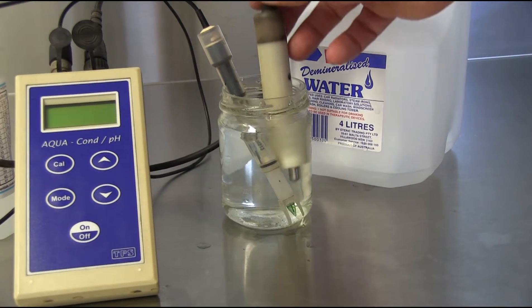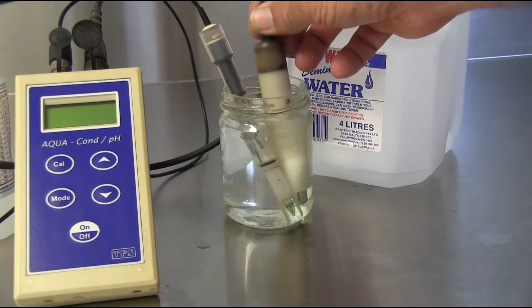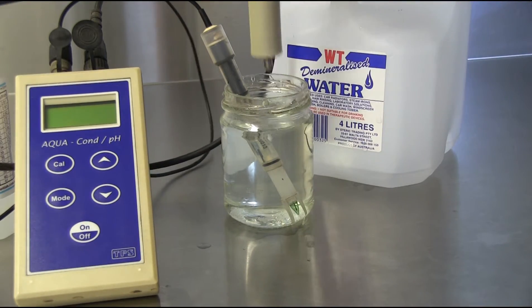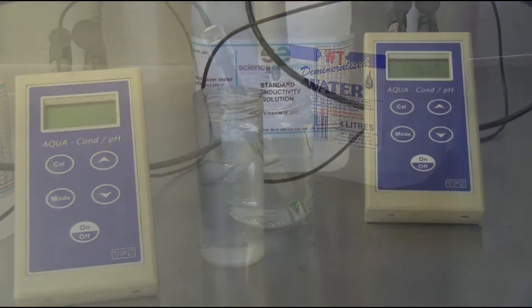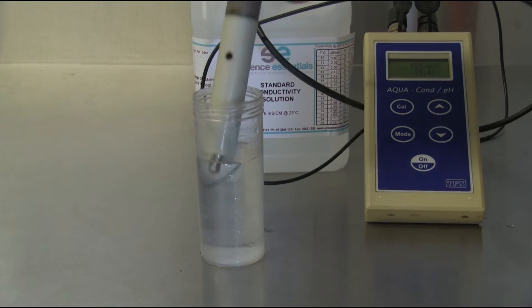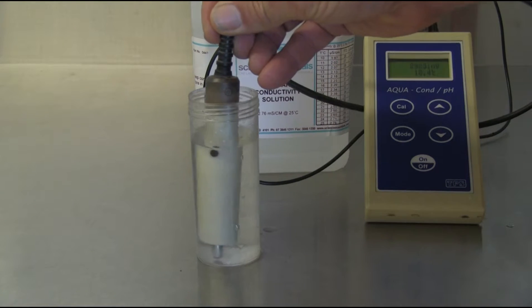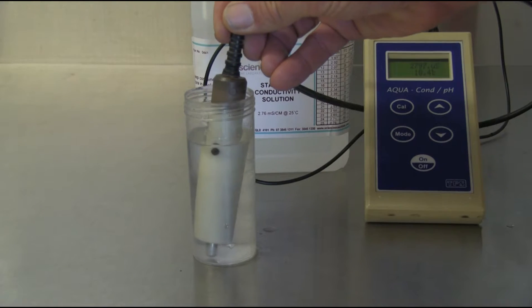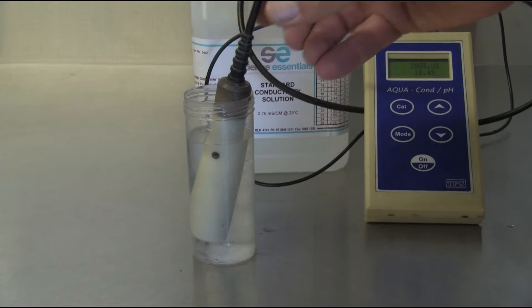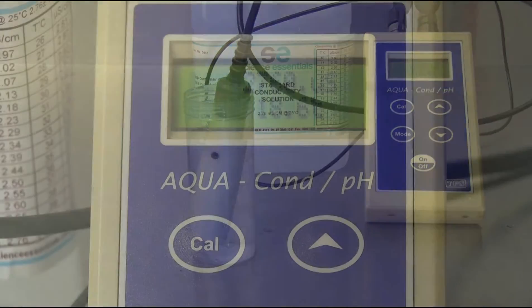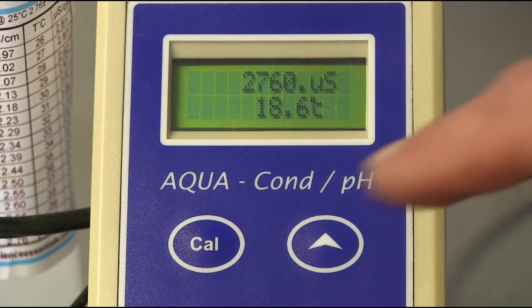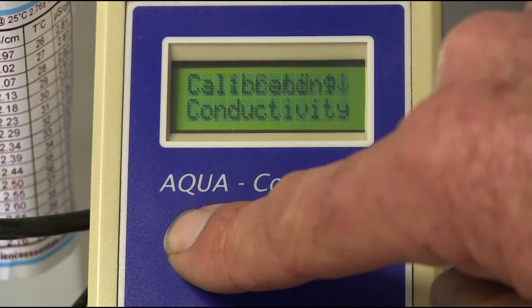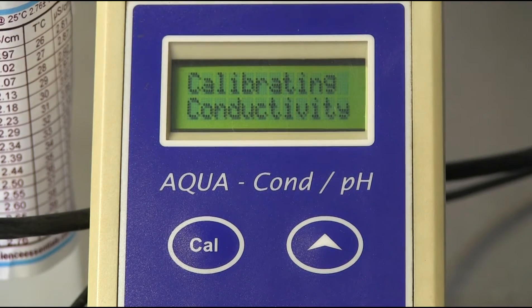Clean the sensor by carefully rinsing in distilled water and then gently shake off any excess water. Immerse the sensor in the standard solution in a plastic or glass container, ensuring the sensor is submerged to the depth of the hole and gently stir until the reading stabilizes. Select the EC calibration mode. Calibrate the meter according to the directions and check the reading.